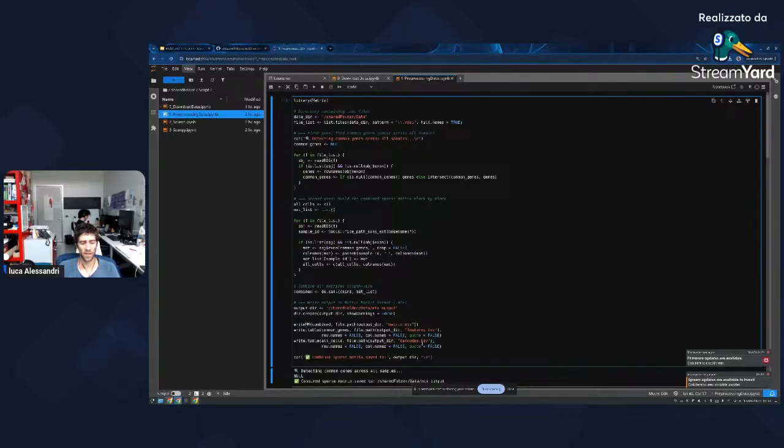It's kind of the standard for single-cell RNA-seq, but it's not the only one. And as we saw before, there is no single clustering algorithm that performs the best on every type of data. So even though most people just use Seurat, it doesn't mean that it's the best.